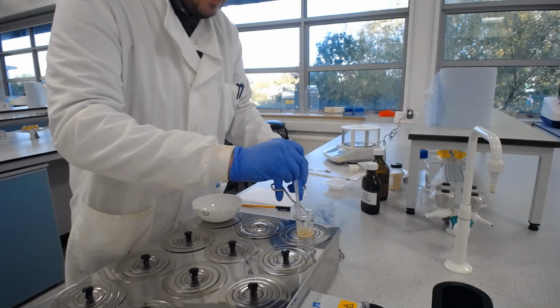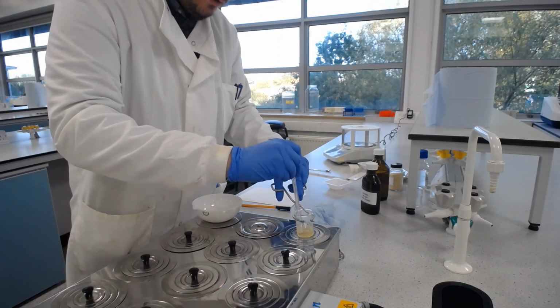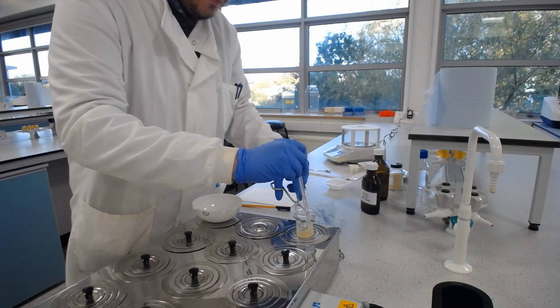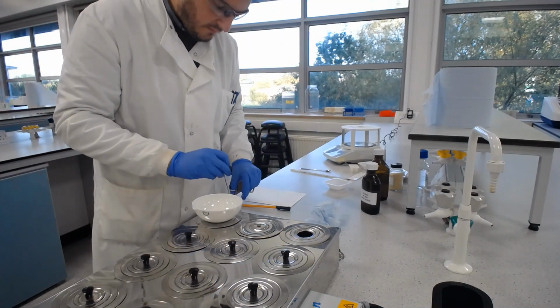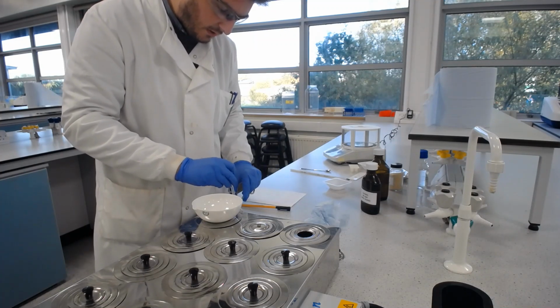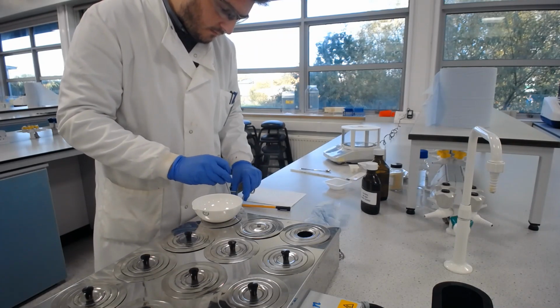And then remember, the next stage is for us to evaporate off all the excess water. But we need to have a nice homogeneous, not grainy, so no grains left, nice homogeneous gelatin mixture. And I'm going to bring that up to the camera so you can see what you need to do. Now you don't want it to be on there for too long because you don't want to create lots of bubbles in your mixture. You want a nice homogeneous, smooth mixture if you can. So just be careful in how you stir it.